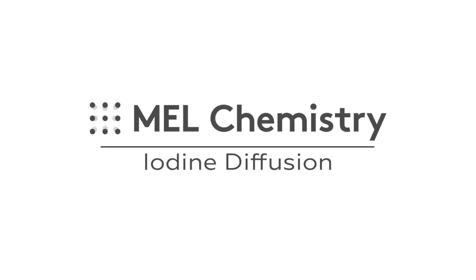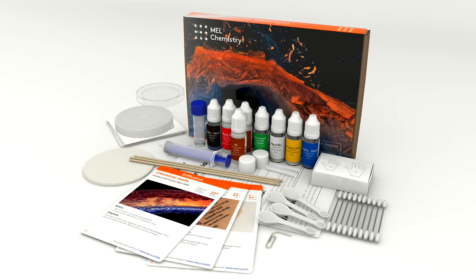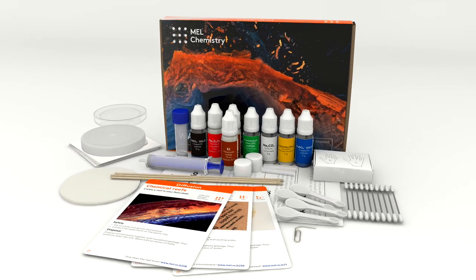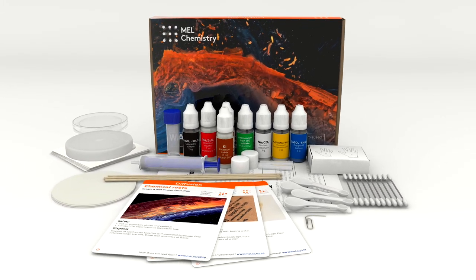Welcome to the wonderful world of chemistry. Today, with the help of the diffusion set by Melchemistry, we will learn how to dye plastic using iodine.